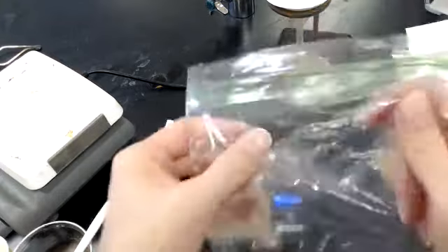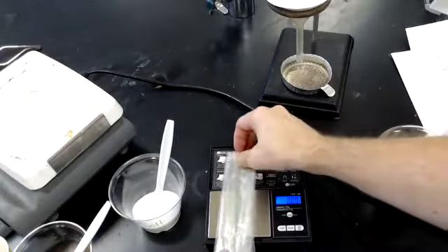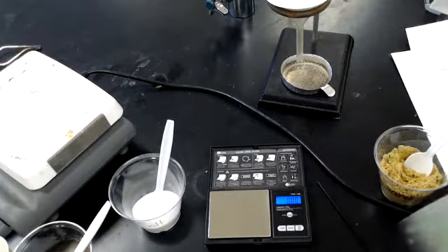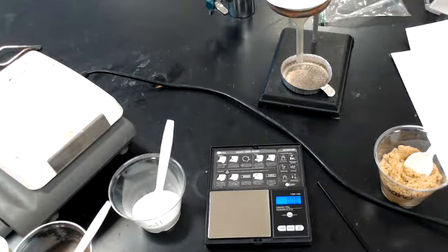Okay, so I'm back with just the empty bag. I'm going to try to fold it up again. There we go. 2.44 is just the bag itself. Okay, now I'm done with this. So I'm going to put the magnet back in. And there we go. And set my magnet aside. I'm done with my magnet.